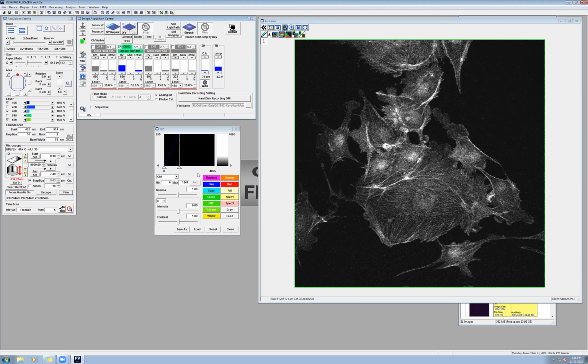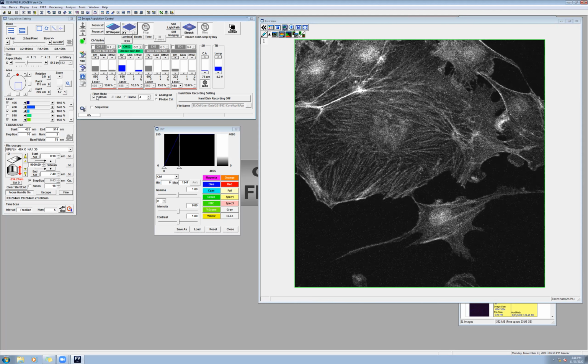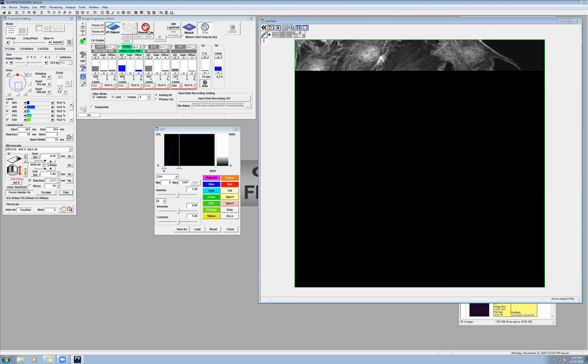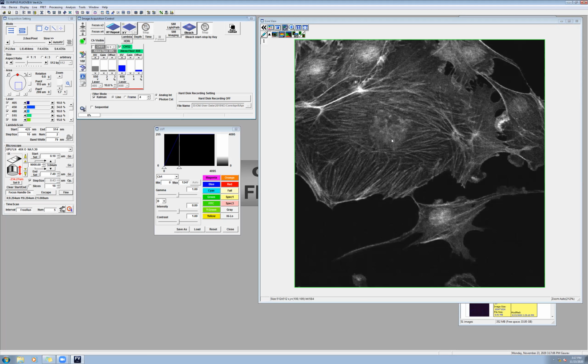The other thing you can do is an actual zoom onto your site. So I'm going to zoom into my sample. Let's say I zoom at like 1.7, and this is my area of focus. I can do an XY repeat, and now if I enable my Kalman averaging and do this again, it looks much nicer, right?